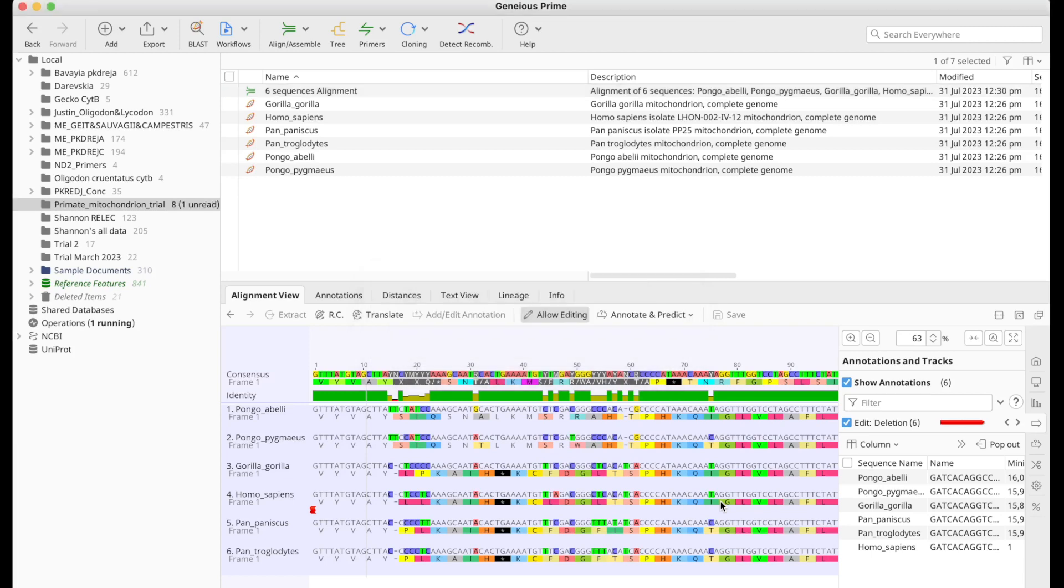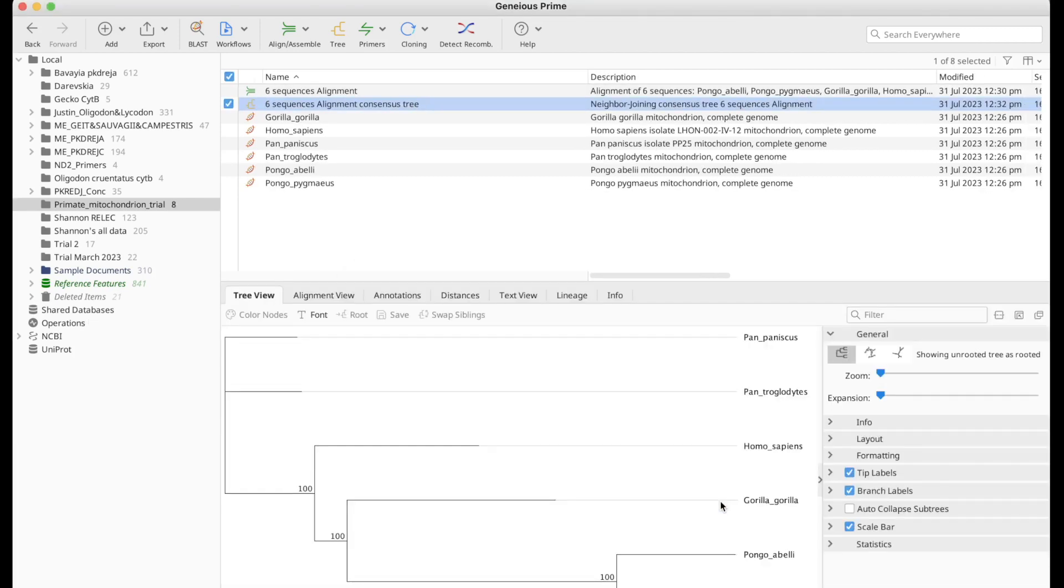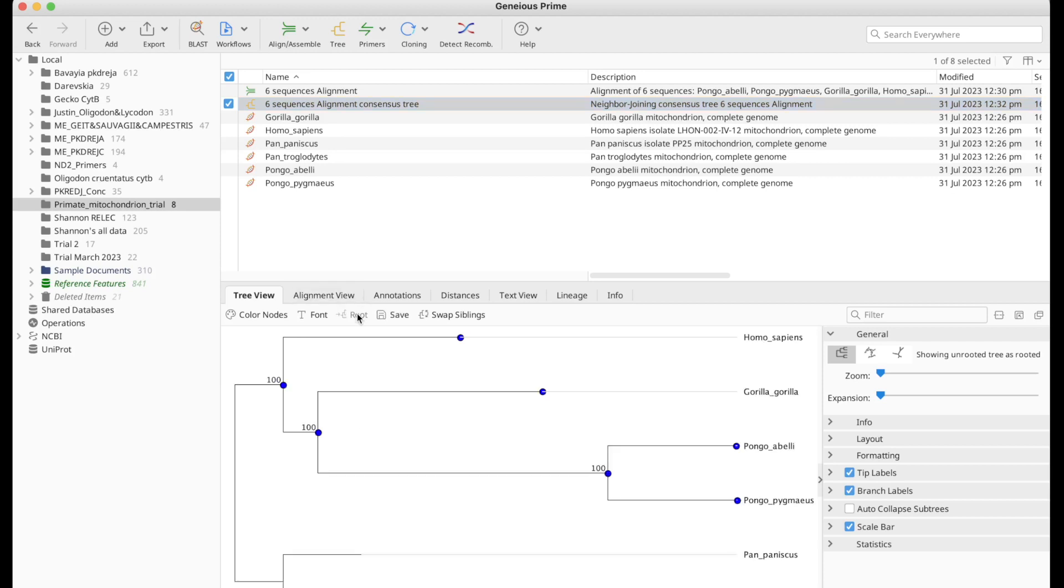This shouldn't take too long. And this is the tree we get. So what I'd like to do is reroot the tree by clicking on this. Click on root. And now what we see is we got Homo sapiens, we got Gorilla Gorilla, Pongo, Pongo Pygmaeus.